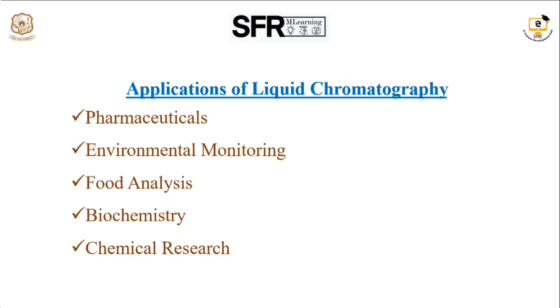Next, the applications of liquid chromatography. There are many fields of application: pharmaceutical, environmental monitoring, food analysis, biochemistry and chemical research. In the pharmaceutical industry, it is used for drug purity testing and stability studies. Environmental monitoring means detection of pollution in water, soil and air samples. Food analysis involves identifying additives, contaminants and nutritional components. Biochemistry involves protein purification, DNA analysis and metabolic studies. Lastly, chemical research involves synthesizing and separating new compounds.